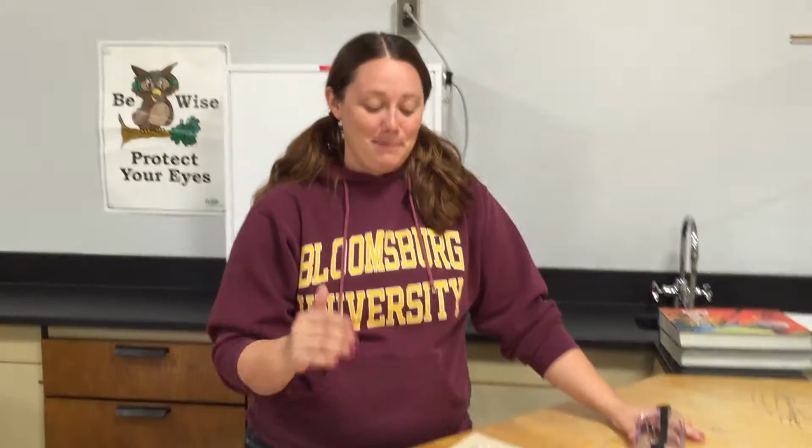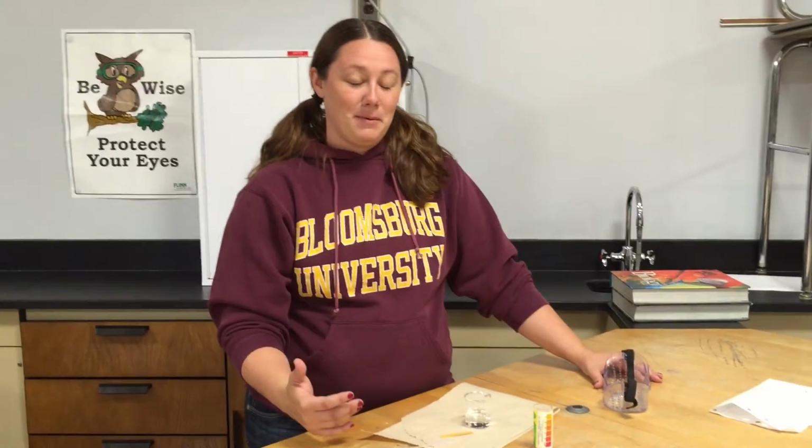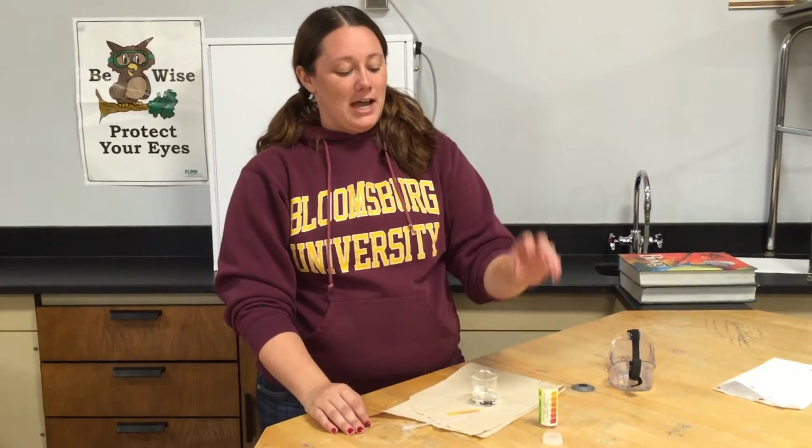All right, hi guys, we're doing pH today. You have a pH lab where you're going to test a bunch of different liquids. For those of you who haven't used pH before, we want to teach you how to do that.